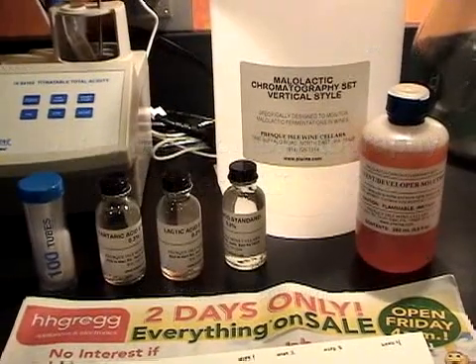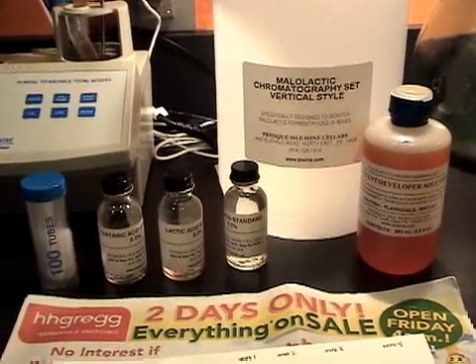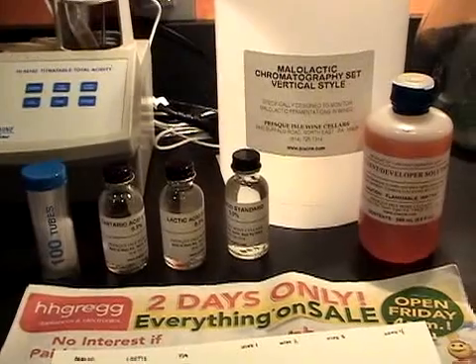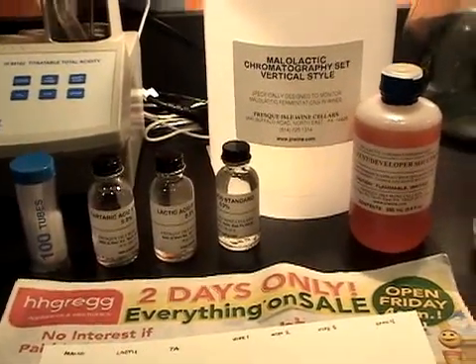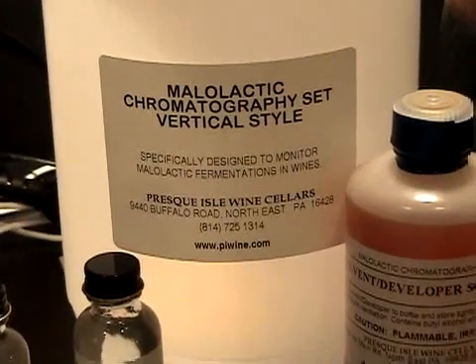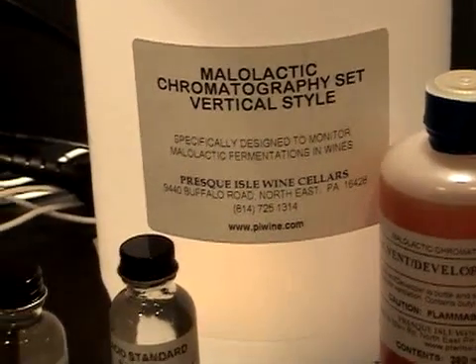I wanted to run a malolactic paper chromatography test. This is where we test to see if malolactic fermentation is complete. I bought this set from Presque Isle, a place that I really like doing business with.